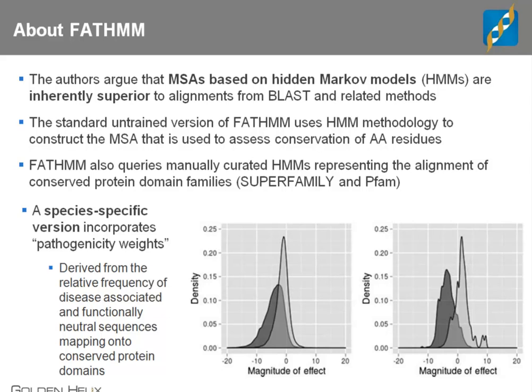So they make the argument that sequence alignments based on BLAST have some inherent flaws, and that a model based on hidden Markov models is much more efficient or more correct, I guess you would say, than the BLAST method, without going into too many details there.